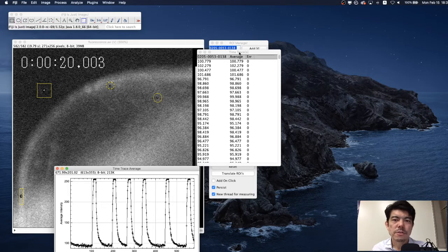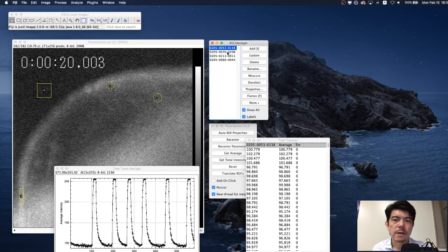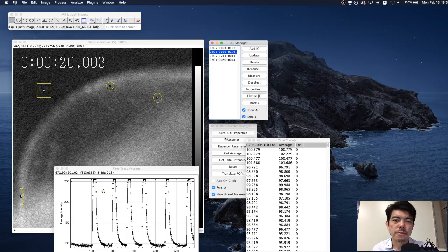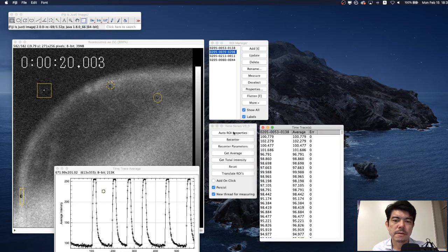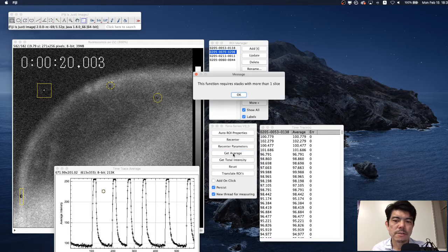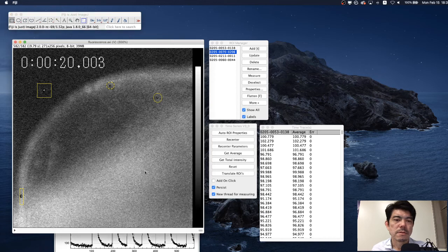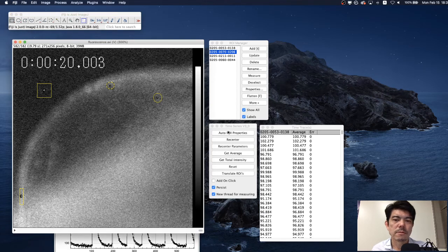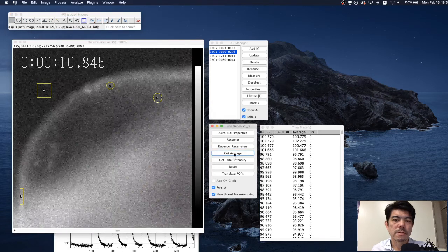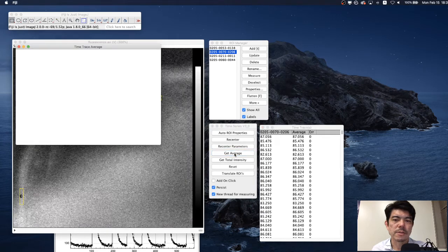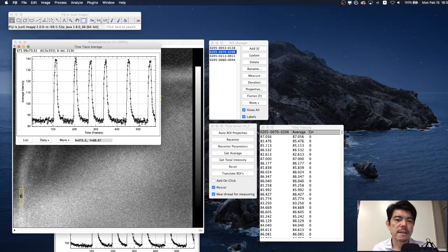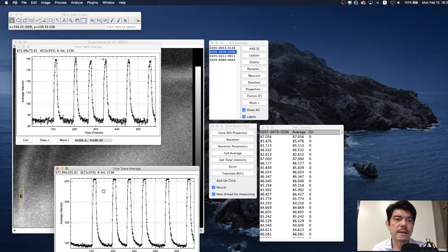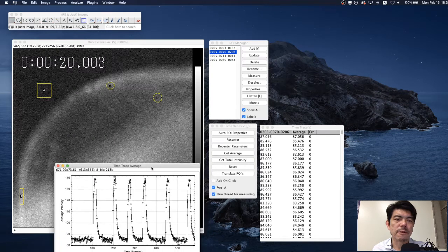Alright, and now we choose ROI 2 and do the same thing. Get average. Oops. Just a moment. Well, it should do. Yes, now it's working. It's nicely analyzed the signal fluctuation in this ROI.